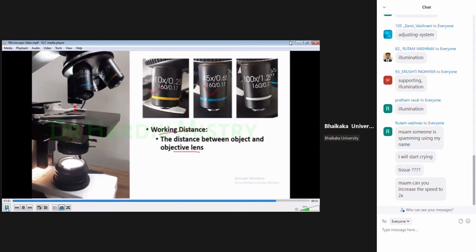And I explained about the light microscope. In the simple microscope, there is no presence of artificial light. There is a simple mirror. There are two sides of the mirror. One side is the plane mirror, and on the opposite side it is the concave mirror. Plane mirror we have to use whenever there is a diffuse source of light or the light is natural, for example natural sunlight. And concave mirror we are going to use whenever the source of light is artificial tube light. So this is all about the monocular compound light microscope.